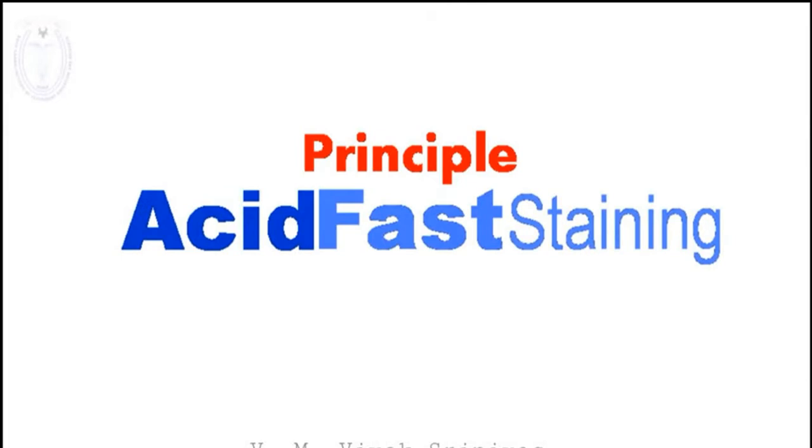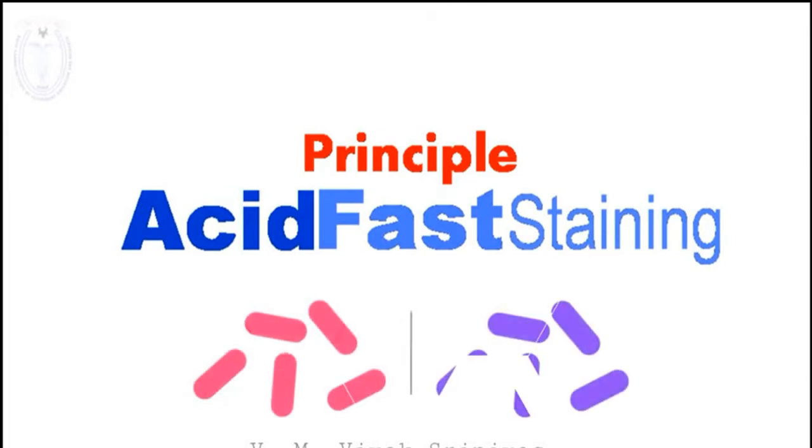The surface of the acid-fast bacteria consists of a lipoidal wall called mycolic acid, which is a waxy material over the mycobacterial surface. But this waxy material is not present over the non-acid-fast bacteria.